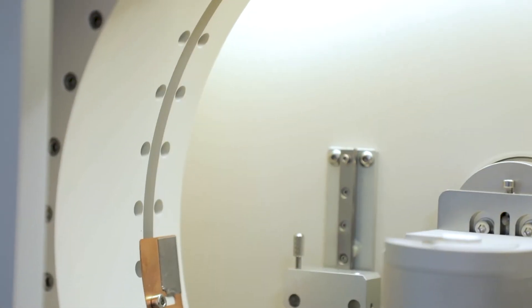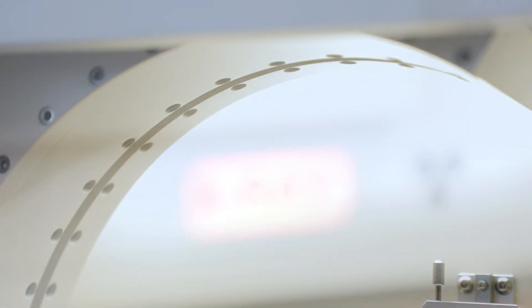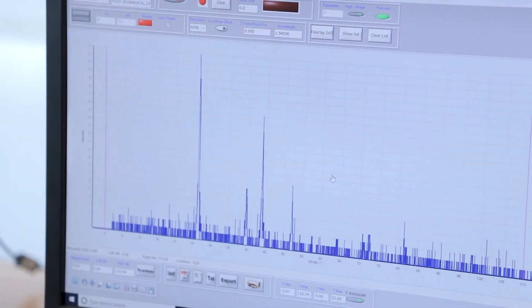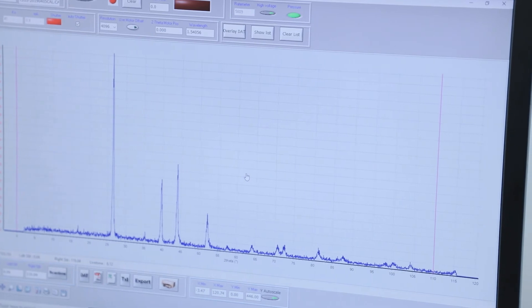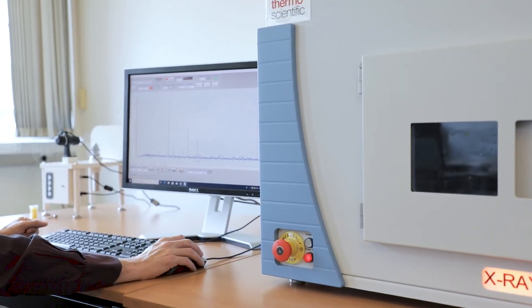The CPS real-time detectors are unique acquisition tools that collect all diffraction data simultaneously. These detectors can perform diffraction experiments on powders, bulk material, and thin films, all in real-time, enabling not only fast analysis but also dynamic studies.